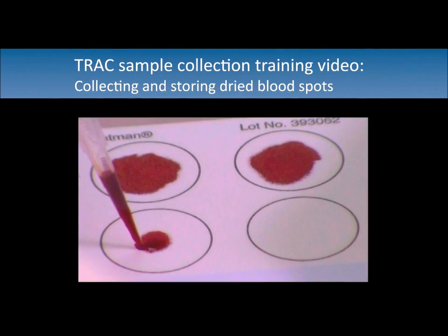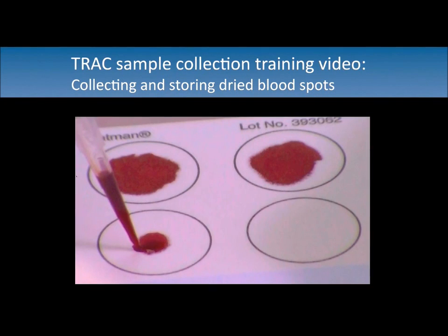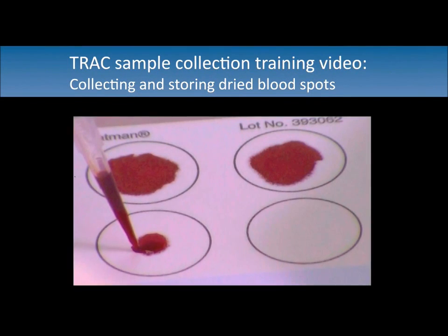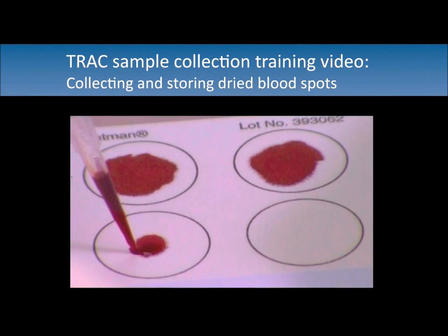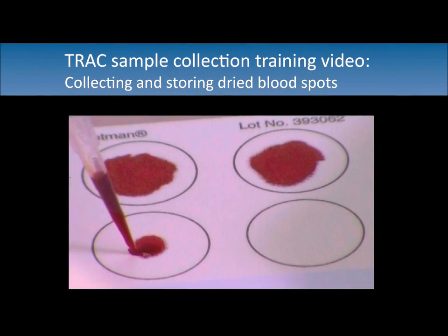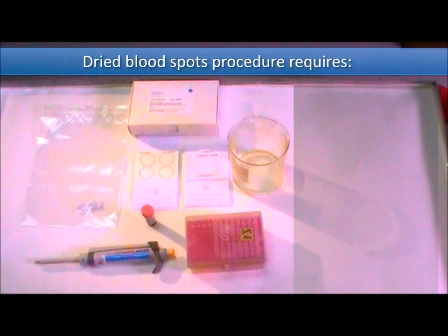This video demonstrates how to collect and store dried blood spots for genetic analysis. DNA and RNA extracted from dried blood spots can be amplified and genotyped for candidate gene analysis, real-time PCR, and determination of recrudescence versus reinfection.